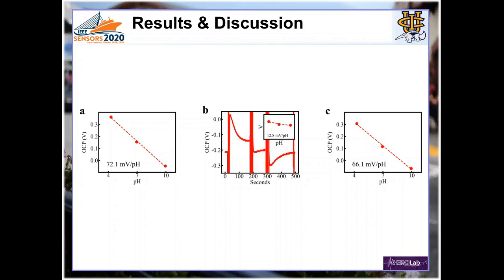Of course, this does not always work. This is an example of when it hasn't. So we check a probe on, let's say, day 13 of use. We run a cal 2 times, and what we find when we come back to the probe on day 15 is that the probe is not really operational anymore. Now we have this pretty severe drift. But if we allow it to just rest for another 2 days, we come back and we have a usable probe.